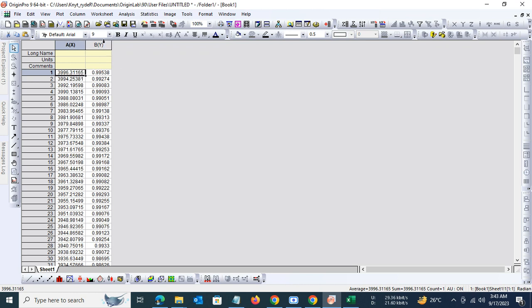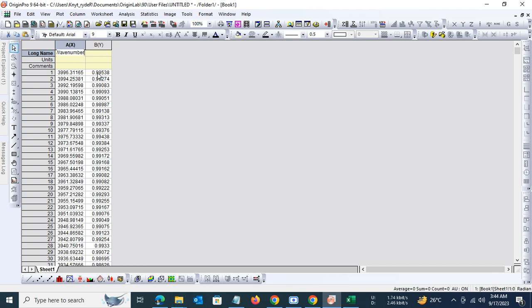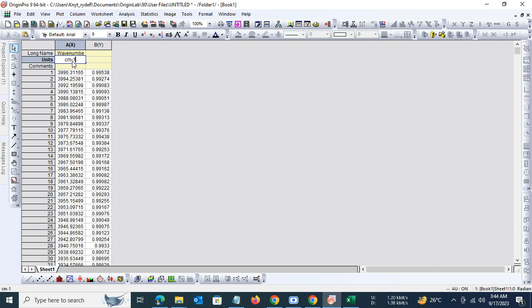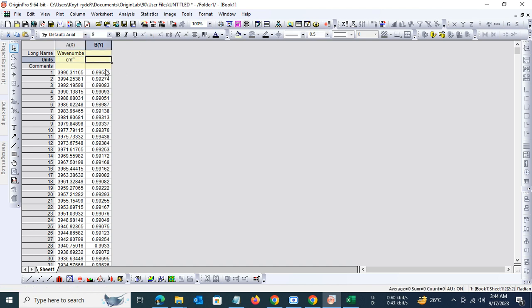Now on the x-axis we have wavenumber. We will label it as such. The unit for wavenumber is centimeter inverse. We can use the superscript and subscript function to format the unit accordingly. Then on the y-axis we have percentage transmittance.